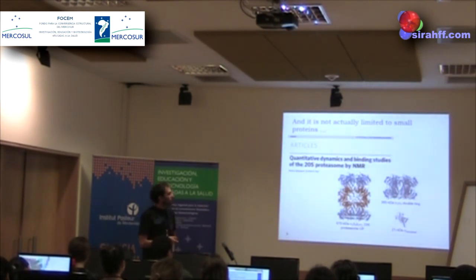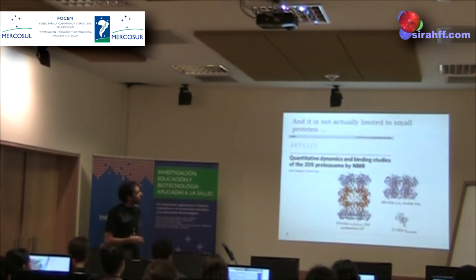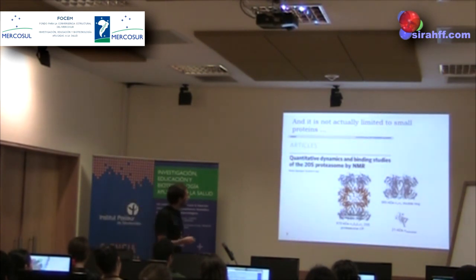And Felipe told you yesterday that NMR is small. I do not agree with that. I can tell you that you can work with bigger systems. This is the biggest system that was ever tackled by NMR, the 20S proteasome. And it's quite large, okay? It's very large.